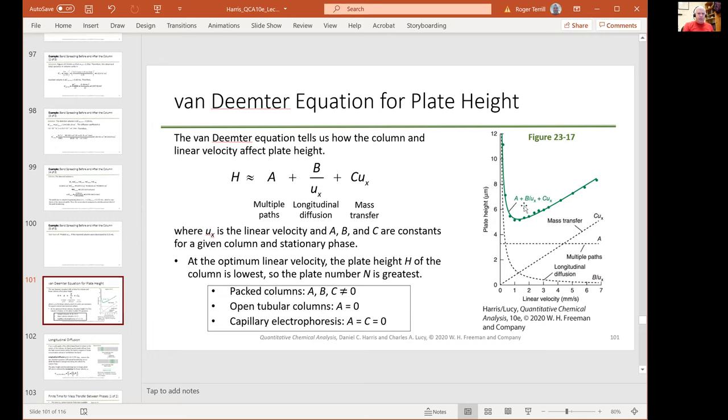So you may ask yourself, where did they get these experimental data from? I can answer that these are from a gas chromatograph. These are from GC, because GC has tons of plates. A good capillary GC will produce 100,000 theoretical plates. That means that the height equivalent of the theoretical plate will be very small and the column will be very long. So there will be a lot of potential peaks that you can resolve in a given chromatogram.